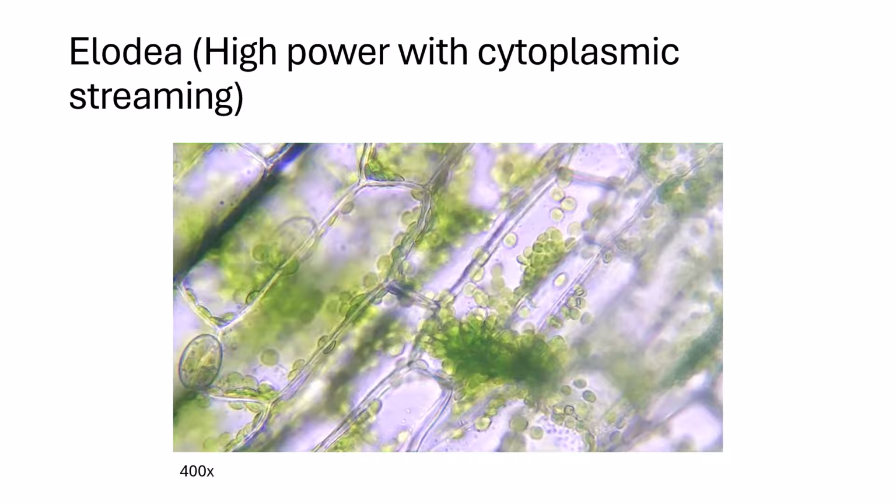And just like with the onion slide, at this point, resist the urge to label everything right away. Slow down, observe carefully, and think about what each structure might be doing.